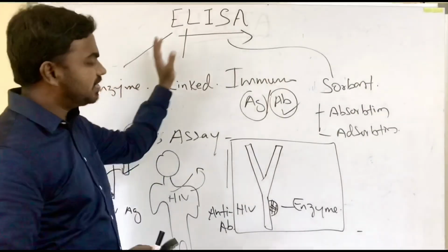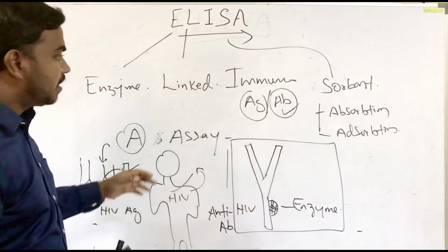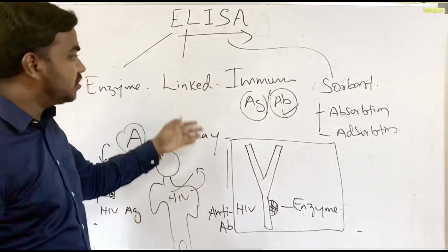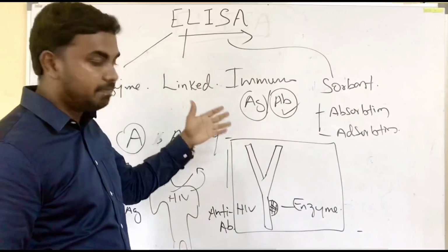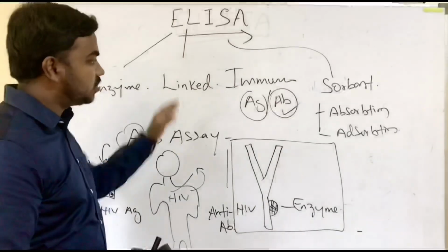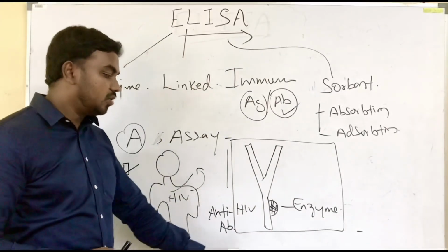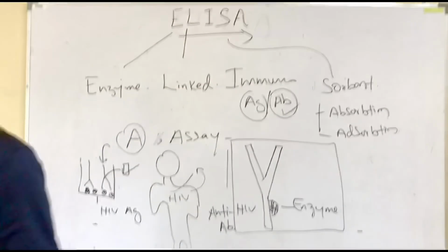So anyhow, this is the basic idea. I didn't go in depth. Maybe in upcoming videos I may teach you about direct ELISA, indirect ELISA, competitive ELISA and sandwich ELISA. Once we go through all those things, you will get a clear-cut idea. So far, thank you.